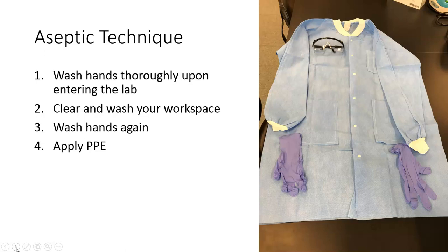After you've put your materials away, you'll want to wash your hands thoroughly to remove as many microorganisms as you can from your hands. Be sure to use soap. This reduces the number of unwanted microbes brought into the lab from outside.